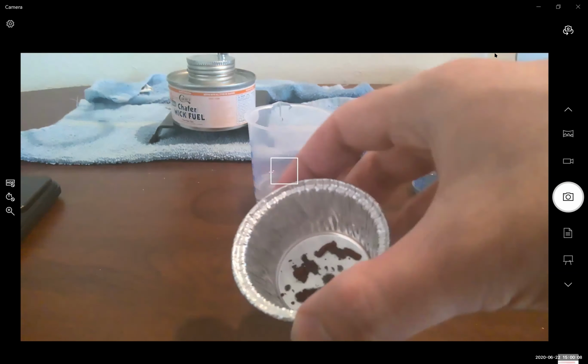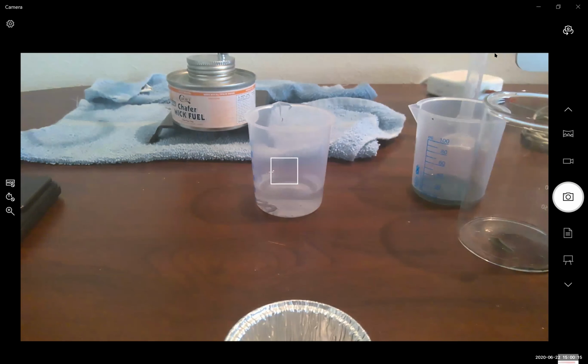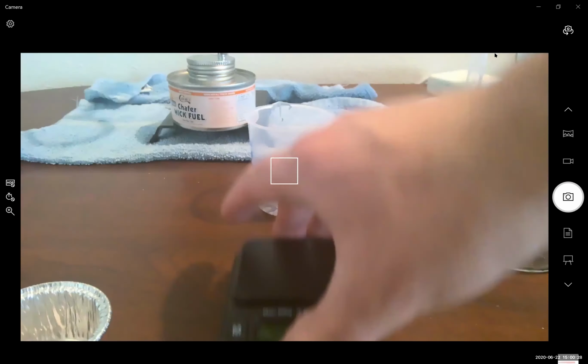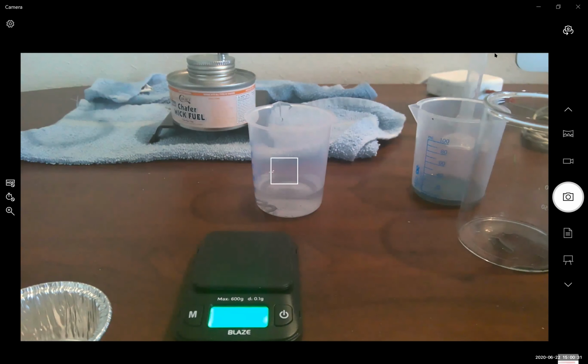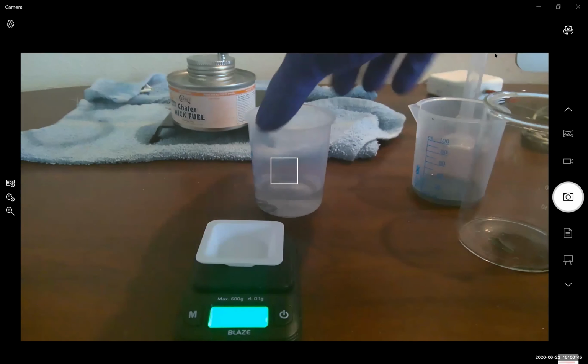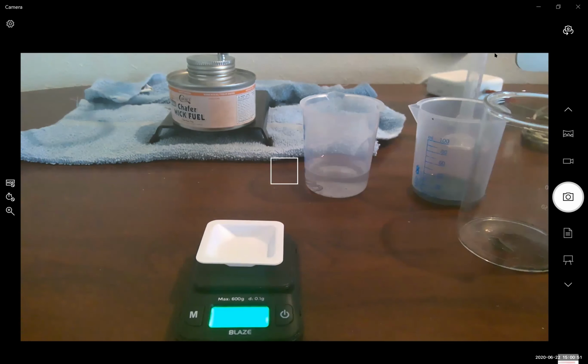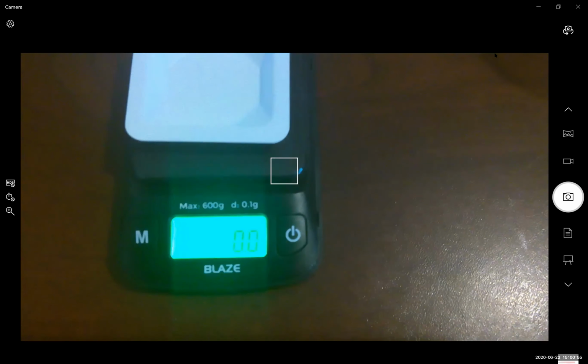completely drying our copper in the oven. Here is what our dried copper looks like. Now, what we're going to do is carefully transfer our dried copper onto a tared balance containing a weigh boat. So we're going to place the weigh boat. Here we go. Then we're going to tare our weigh boat by pushing the tare button. Okay, so with the weigh boat on, it should read 0.0.